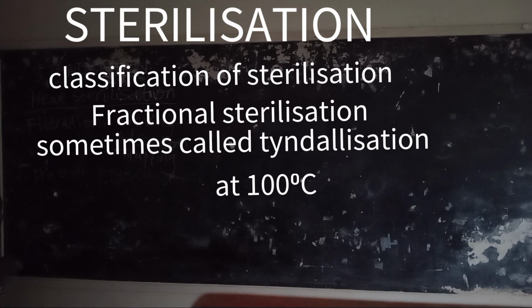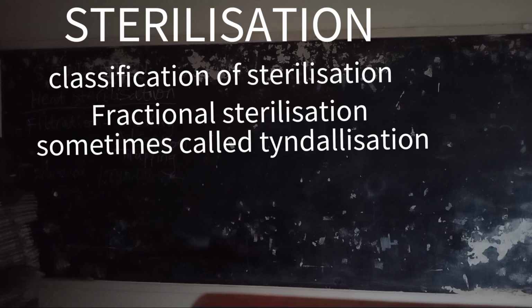It was discovered by a man called Tyndall, which is why it is called Tyndallization. We boil the liquid at 100 degrees Celsius for 20 minutes, then we leave it to cool.